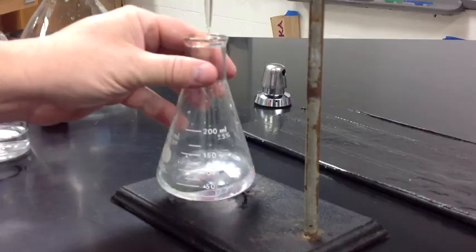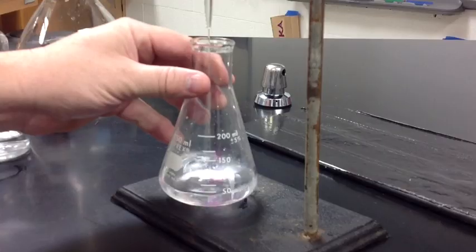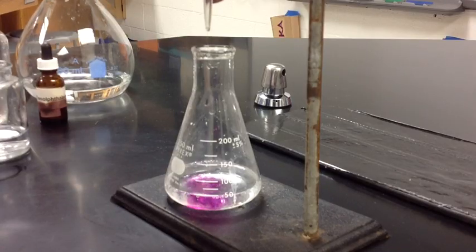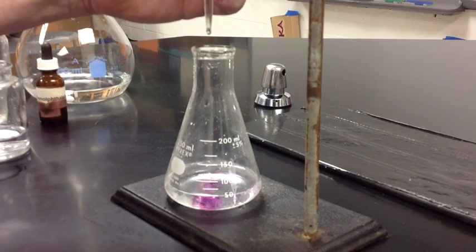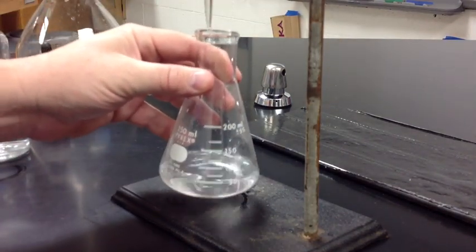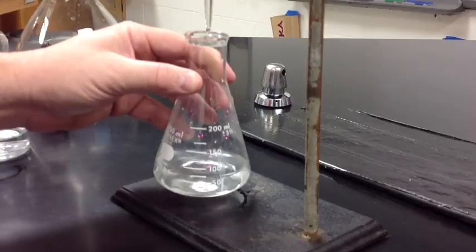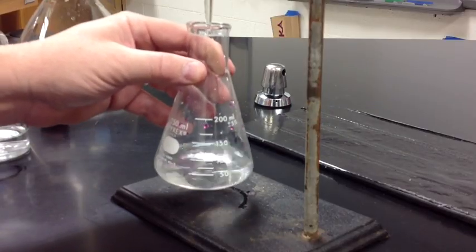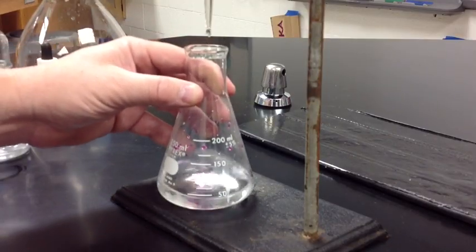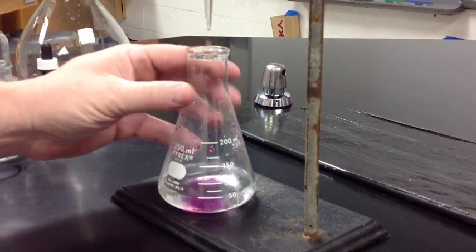Our job as we titrate is to bring it to a point where the pink color holds even though you may swirl it. So I'm going to slow down this process now and go just a few drops at a time. We don't want to go too fast because we don't want to go past what is called the end point. The end point is where the pink color stays, and we want to find that one moment when the pink color remains even though you continue to mix it.